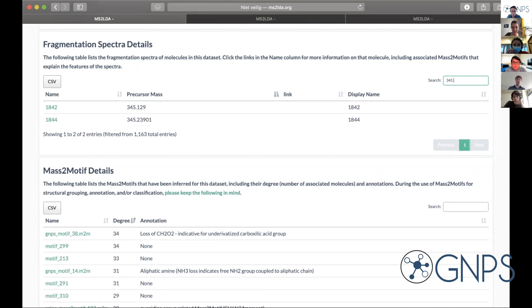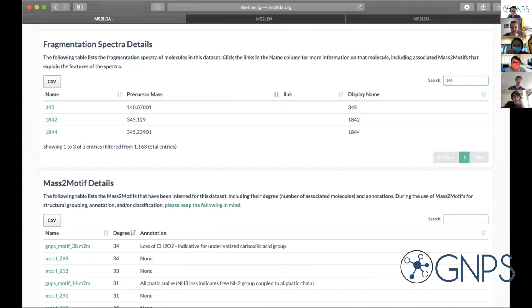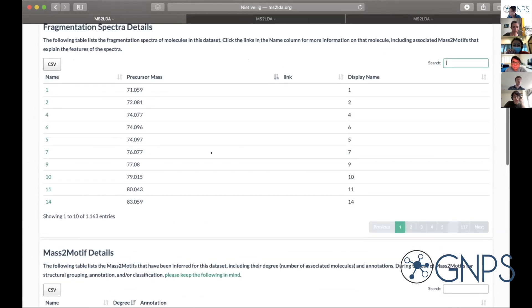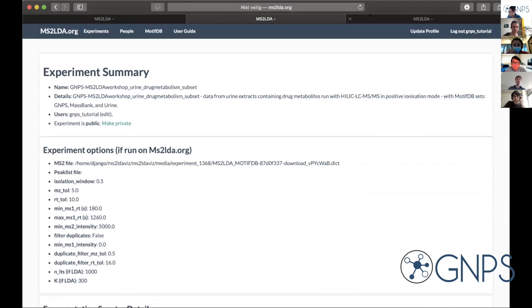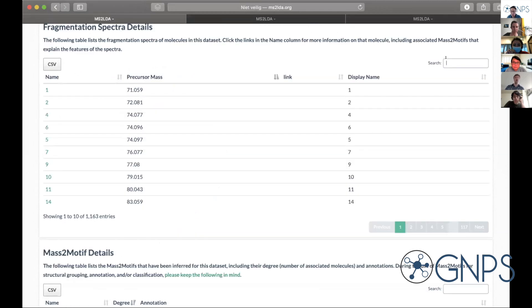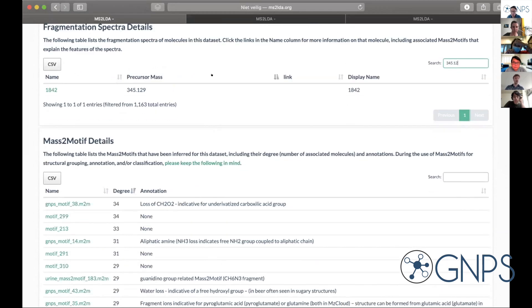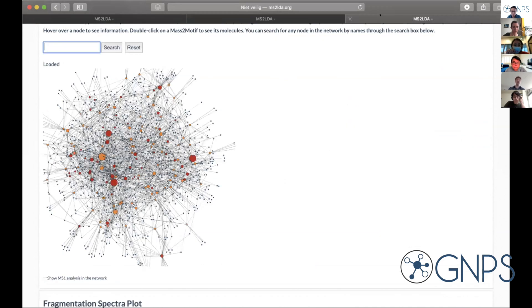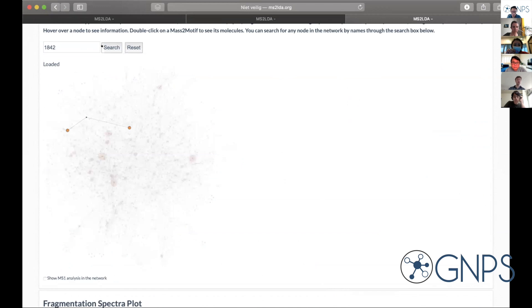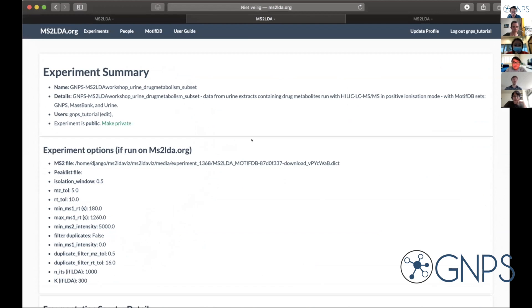Clicking on it, I can see all the motives that are associated with this MZ feature. I can also explore the nearby environment of this feature in the network cluster. In the network cluster — say you found the same mass, let's call it 1842 — typing 1842 in the MS2LDA visualization search, we found it. There it is. Fantastic — we found it and you can see it's linked to two motives. Is that clear? Yes, it was very clear.